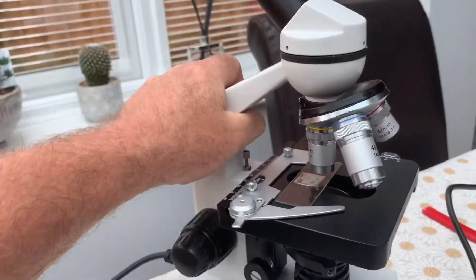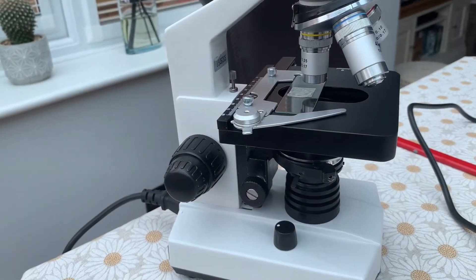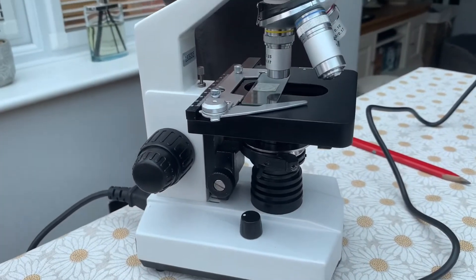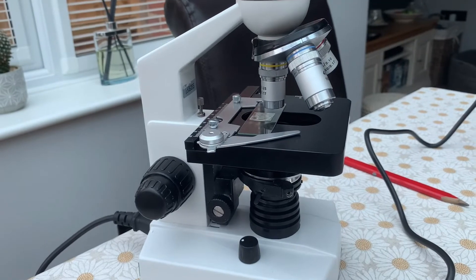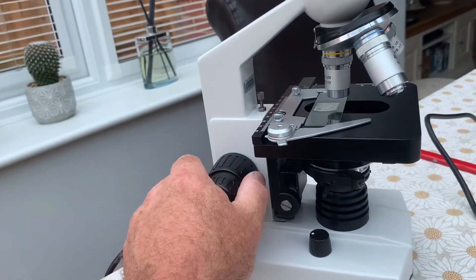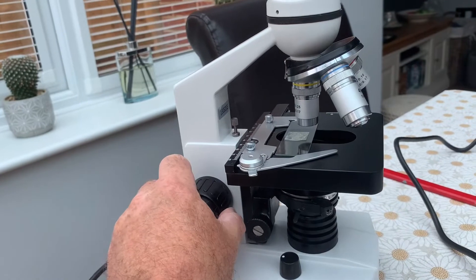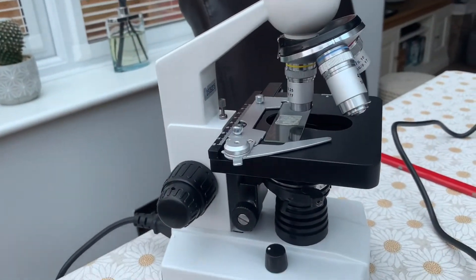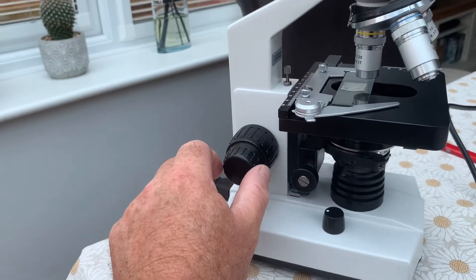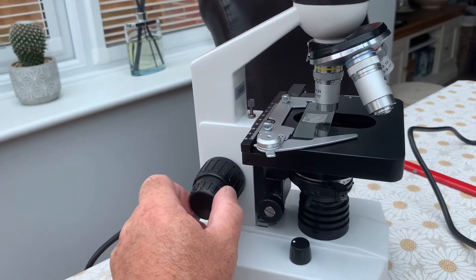The mechanical stage isn't essential — it's on the slightly higher-priced models — but the Apex Practitioner is just over £100. There are other brands like Brunel with microscopes of similar quality at around the same price. Next, the focus knob: that just brings the stage up and down closer to the objective. On cheaper microscopes you only get a single coarse focus, but on this one you also get a fine focus.